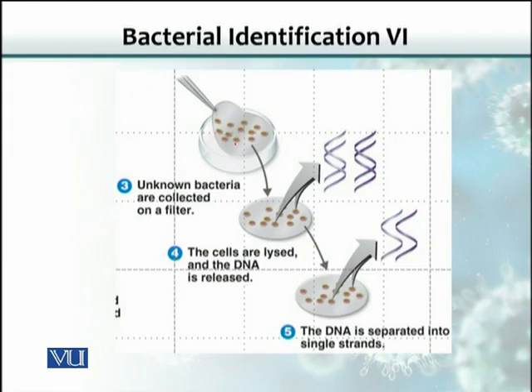So what we would do is transfer those colonies onto a nitrocellulose filter, as we've seen that filter was used in Western blotting. So this technique is also called blotting, but here we are blotting DNA, not proteins. That is the only difference. Because it is DNA, we know it's double stranded. After transferring the colonies onto the filter membrane, we would lyse the cells, releasing the DNA in such a way that the released DNA sticks onto the membrane where the colony was, leaving an impression of the DNA in the form of a colony.